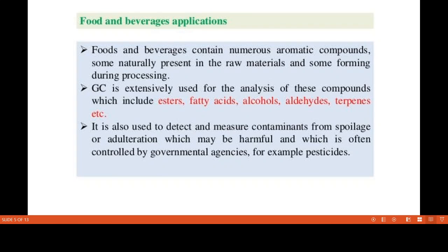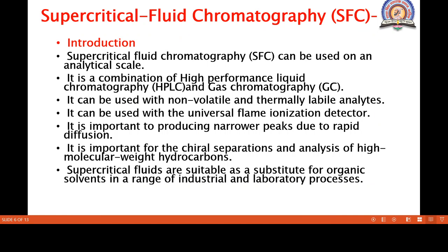Student, you must understand the meaning, definition, principle and applications of gas chromatography. Okay, then we start the second topic, that is supercritical fluid chromatography. In short, we call it SFC.